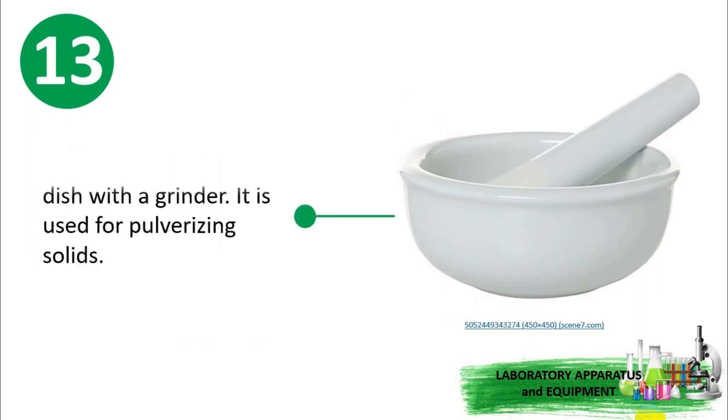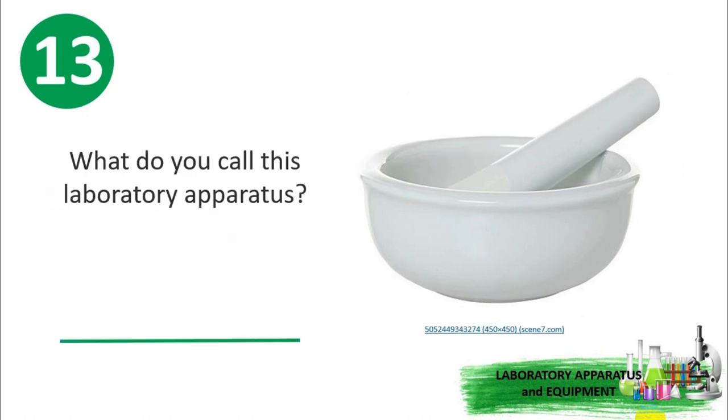Number 13. This apparatus is a heavy porcelain dish with a grinder. It is used for pulverizing solids. What piece of laboratory apparatus is this?